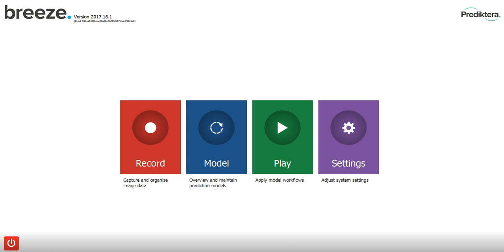Breeze is organized into four different views, each with a specific purpose, as noted under the button for each view.